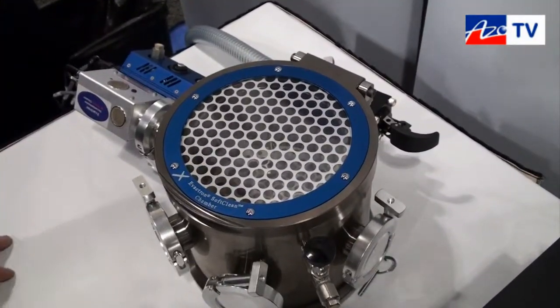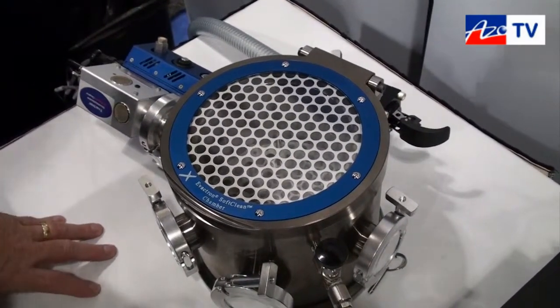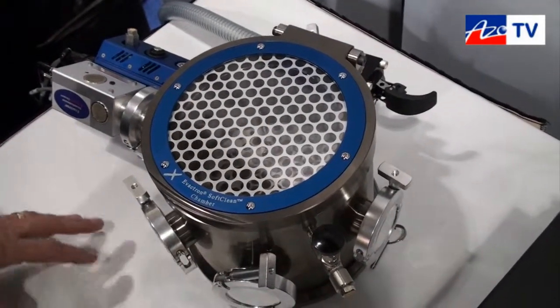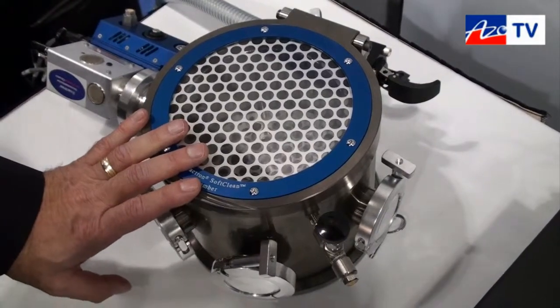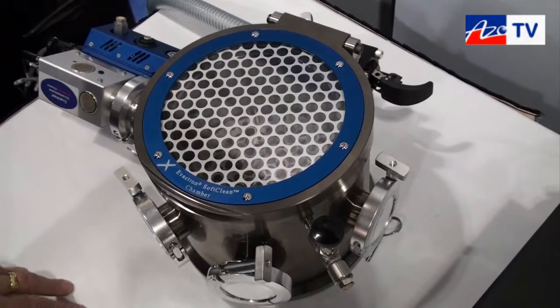And Tom, what's the reason why it's so important to remove all these contaminants? Well, we live in a dirty world. And these contaminants, if they're in the system, will interfere with the resolution that the microscope can produce. They will interfere with the analytical data that the microscope can produce.